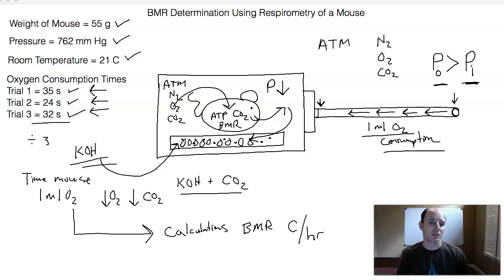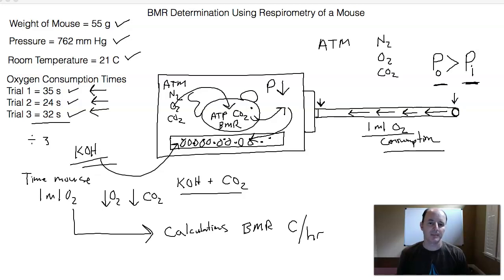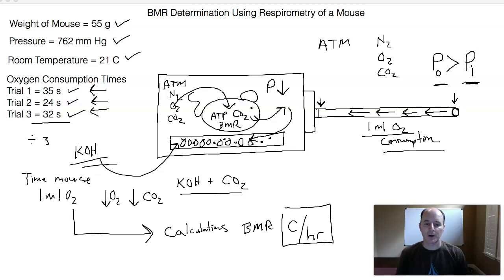Utilizing oxygen consumption, we can figure out calories per hour. Watch the video for the live experiment — the mouse inside the chamber and the bubble moving along the pipette — then take your data for the time it takes to consume one milliliter of oxygen and perform the mathematical calculations to determine calories per hour for your mouse. Once you have that information, you can answer the review questions and finish your laboratory report. I hope this helps. Take care. Bye.